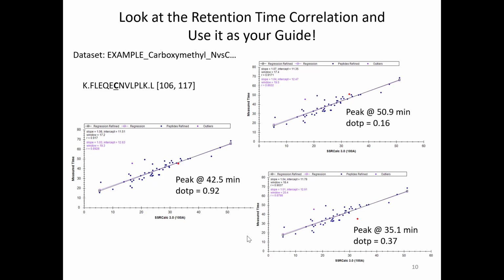How well does this work for modified peptides? And the answer was it doesn't. So if you have phosphorylation, glycosylation, it ignores that. I know phosphopeptides will have different retention times depending on which site is modified. Some of them may coelute and some of them may chromatographically resolve, and this cannot predict that. There may be other calculators that can, but usually measuring the empirical retention time, and then using IRT will nail it every time.